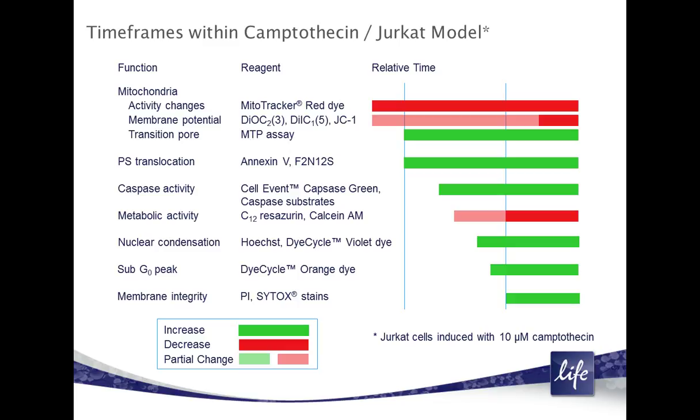So I'm going to be talking about a number of different assays. For the most part, I'm going to be using a Jurkat model with camptothecin-induced apoptosis and talking about a number of different assays throughout this process.